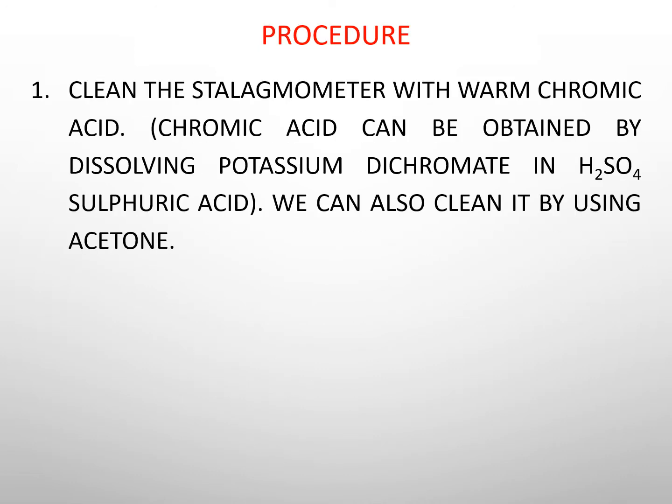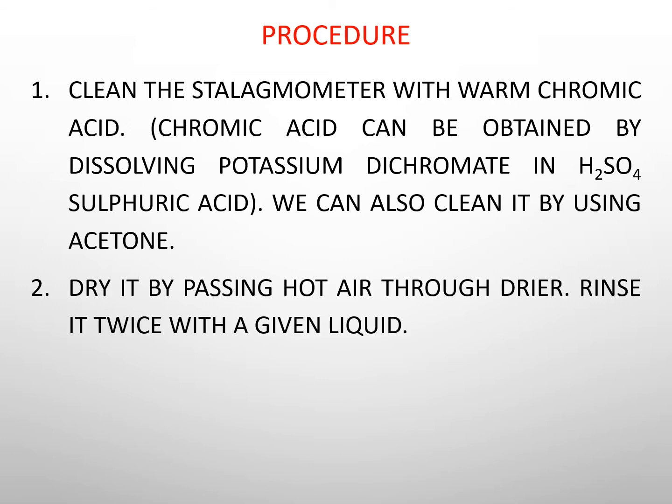Procedure: clean the stalagmometer with chromic acid. We can also clean it by using acetone. Dry it by passing hot air through a dryer. Rinse it twice with the given liquid.